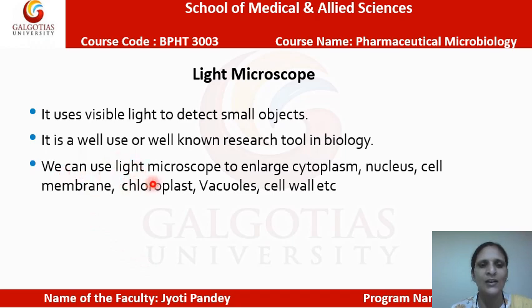This is a light microscope which is useful to enlarge cytoplasm, nucleus, cell membrane, chloroplast, vacuole, cell wall, etc., components of any cell.